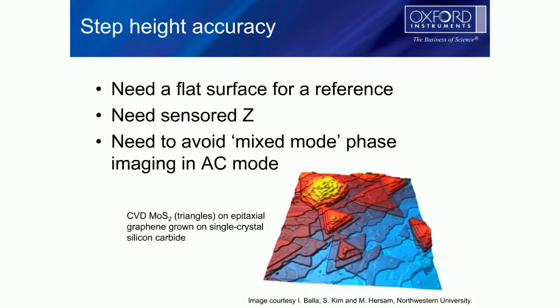And then finally, we need to avoid imaging in what we call mixed phase mode. Mixed mode phase imaging is not good. And I'll explain why here in a moment.